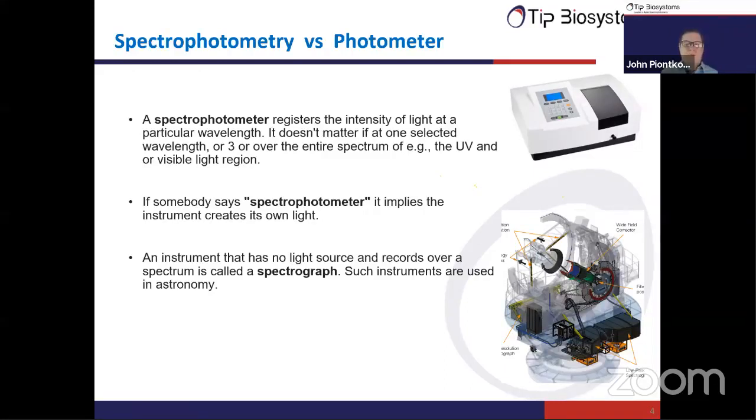So usually if we say spectrophotometer, we imply that it's an instrument, mainly a benchtop instrument, that contains its light source, and it contains something that's a monochromator and so on. Sometimes there's also this term spectrograph. So what is a spectrograph? Actually, a spectrograph is an instrument that records the light intensity over a certain area of the spectrum. And those types of spectrographs are used in astronomy or to study the sun, what type of rays the sun is emitting.